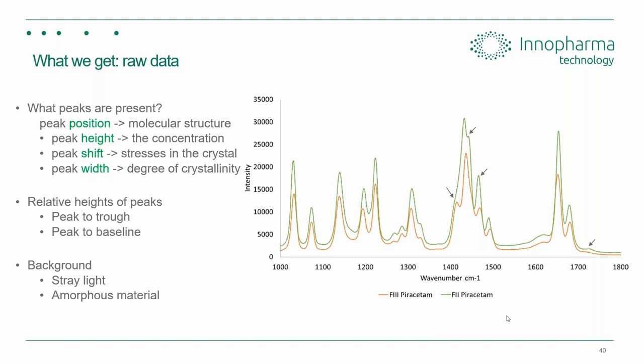Okay, so the other question that I skipped over and said I wanted to come back to: could high frequency signals, Bluetooth, 3G, 4G, and so on, also impact? Depending on the wavelength range of your detector, absolutely. Those signals are electromagnetic signals, and if you have a detector that's sensitive in those ranges, then it will absolutely interfere.